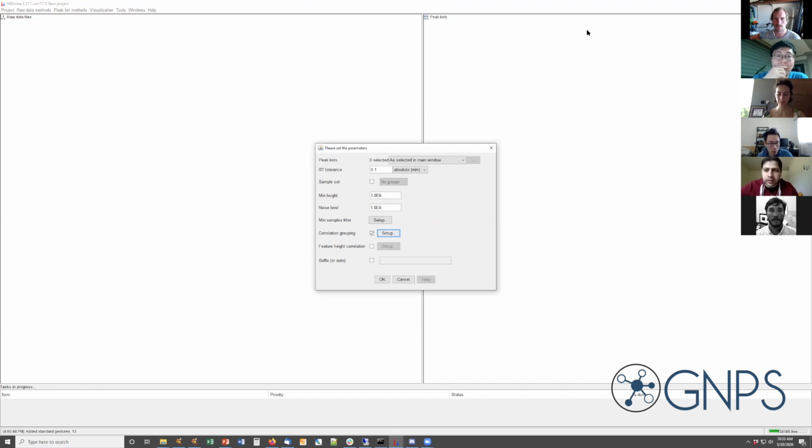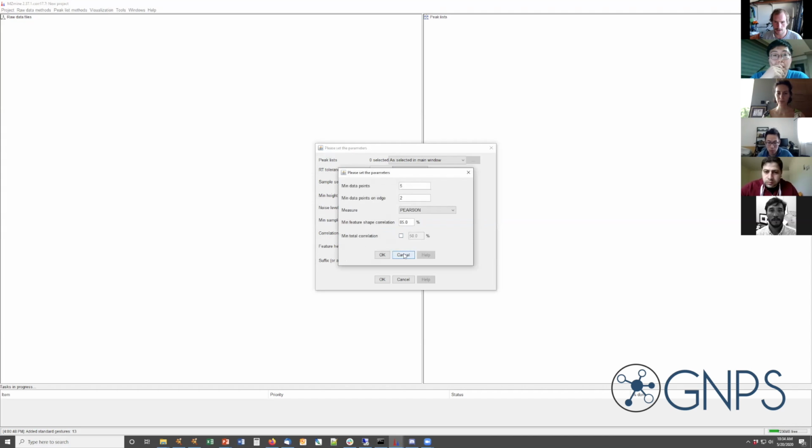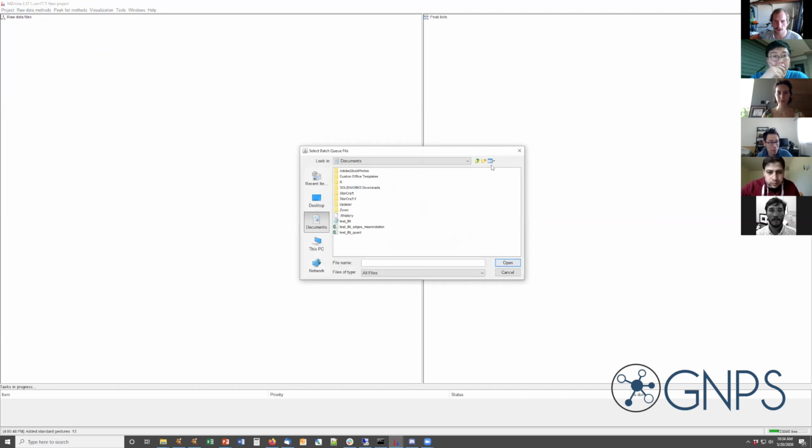So, if I run the correlation module after the join aligner, will the module calculate the correlation across the multiple samples? Yes. Okay. So maybe it's a good idea to show the chromatogram plot. Let me just execute it then, because I do not have it loaded right now.